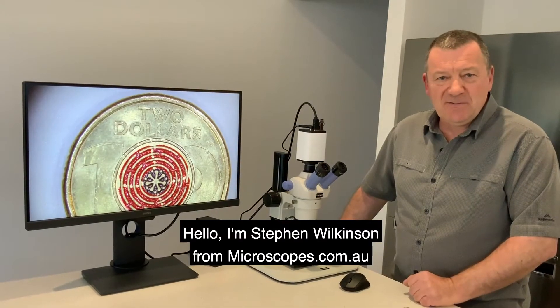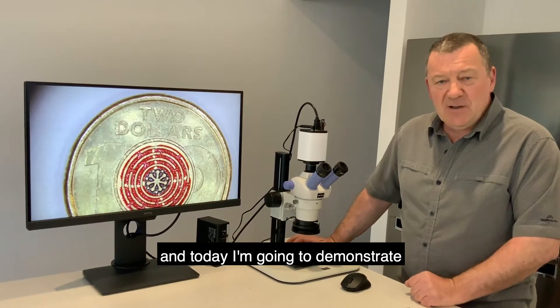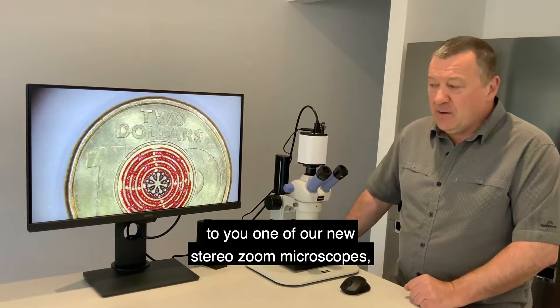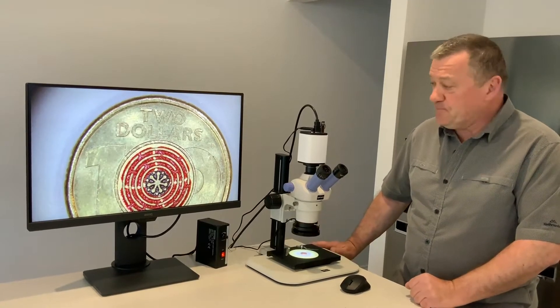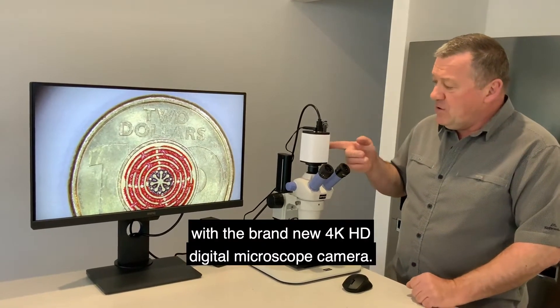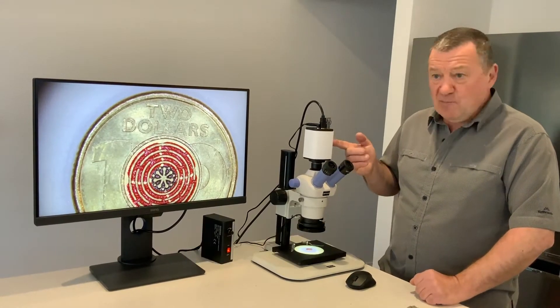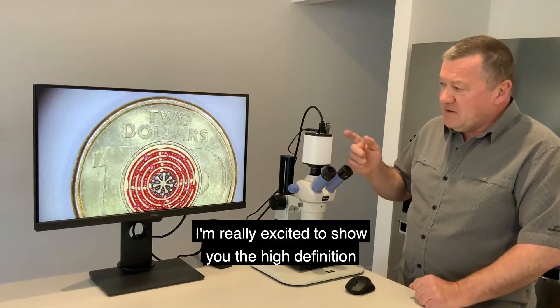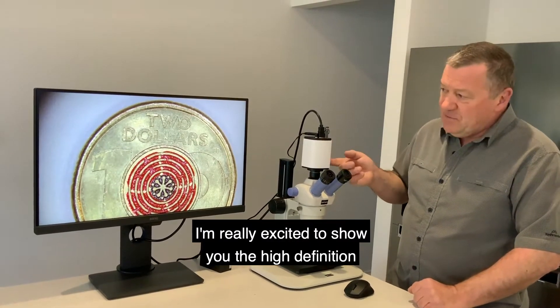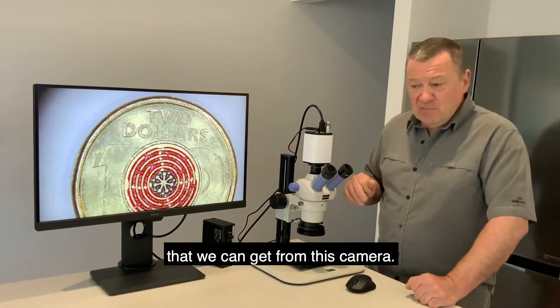Hello, I'm Stephen Wilkinson from microscopes.com.au, and today I'm going to demonstrate one of our new stereo zoom microscopes with the brand new 4K HD digital microscope camera. We only got these in this week and we're excited to show you the high definition that we can get from this camera.